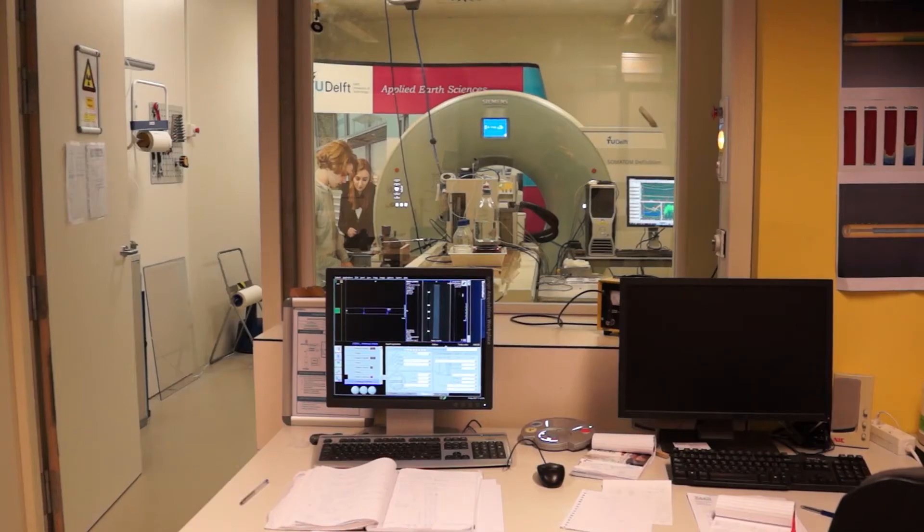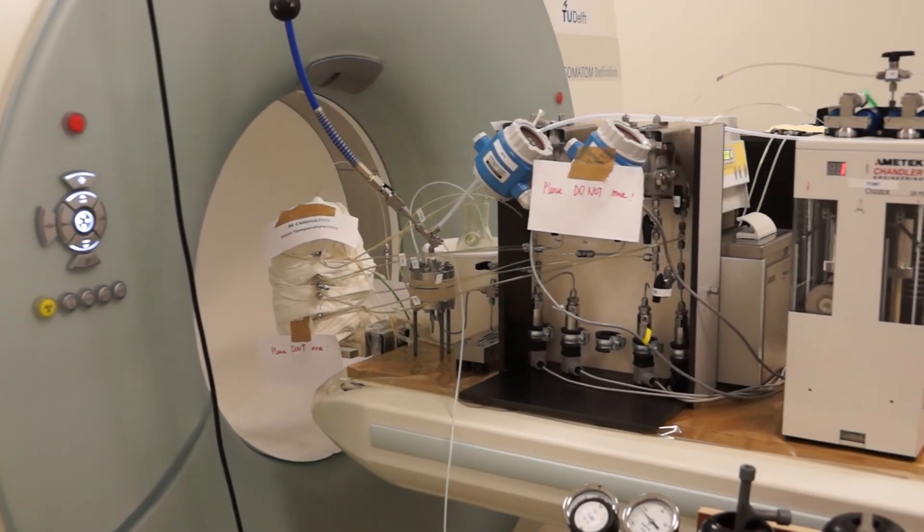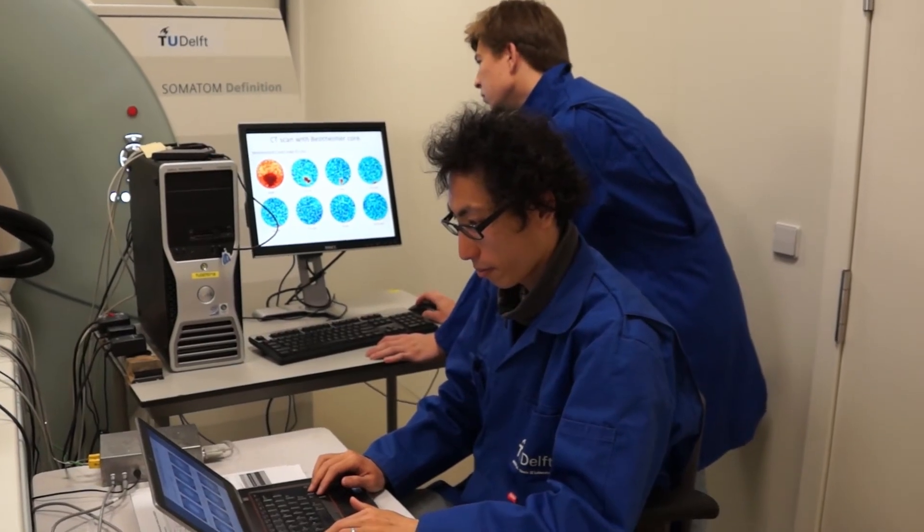Finally, we can actually see what happens inside the core using an X-ray computer tomography machine. What you see here is the same technology that's used to image inside the human body in a hospital. Here we use it to see the interactions of fluids inside the rock.